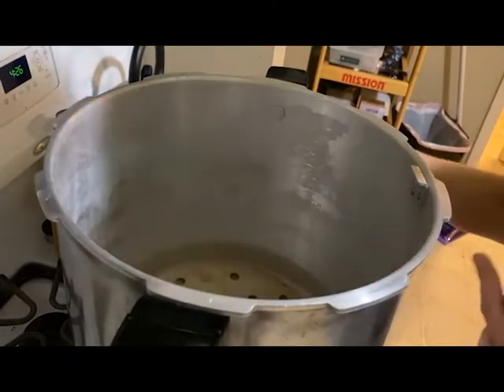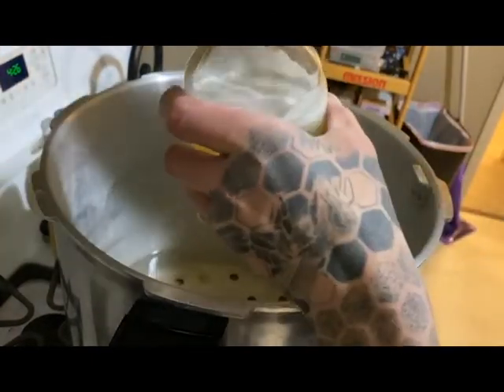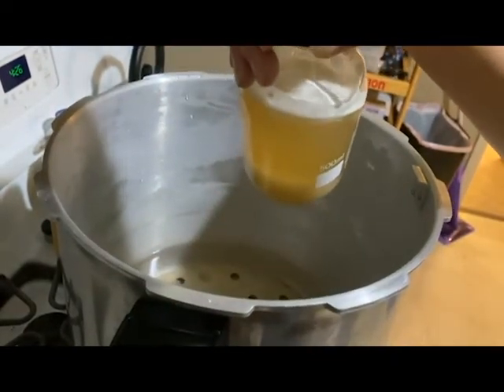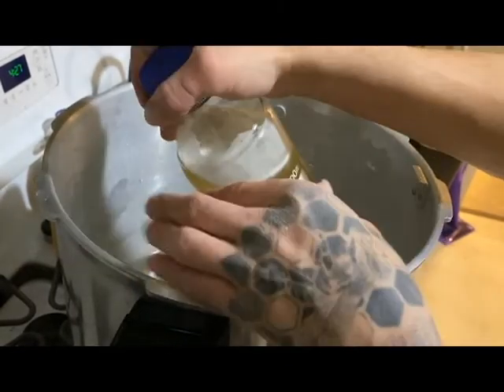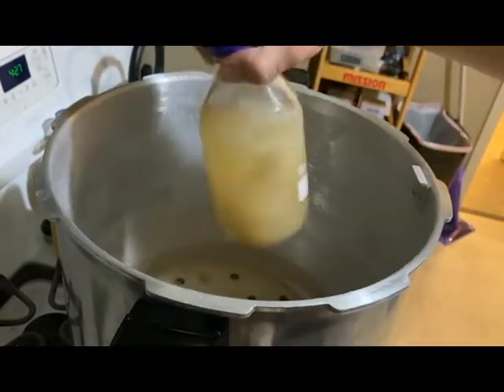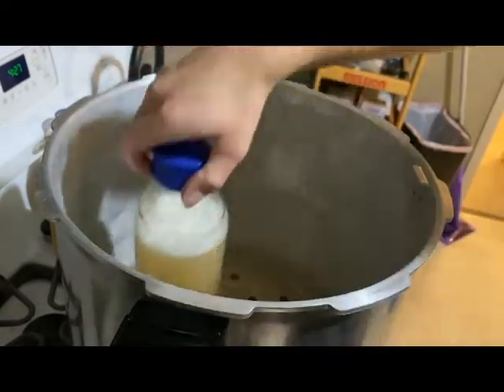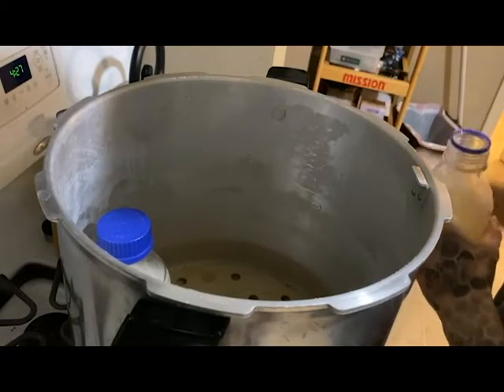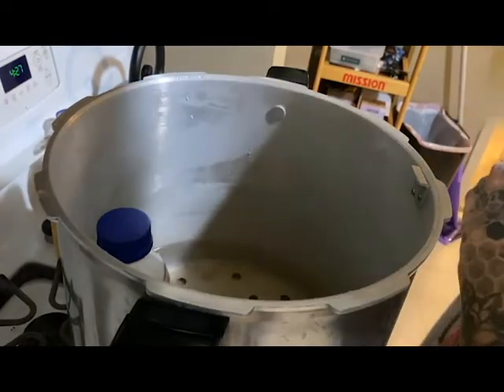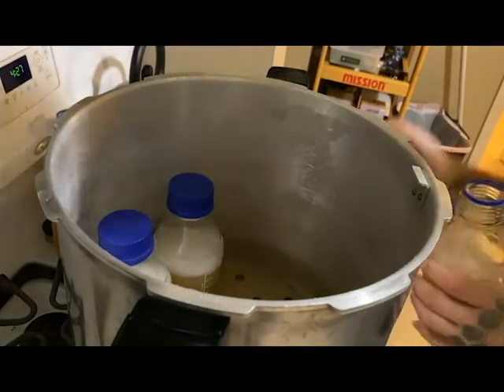Okay, so next up, we will cap this. What I like to do is turn and twist the lid all the way on, and then I give it a slight untwist back. Obviously, you want to mix it up first. Load them up like so.